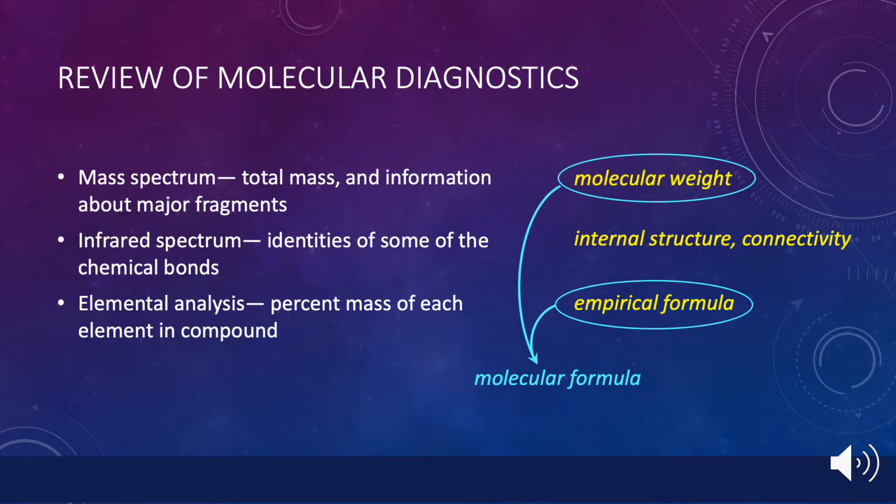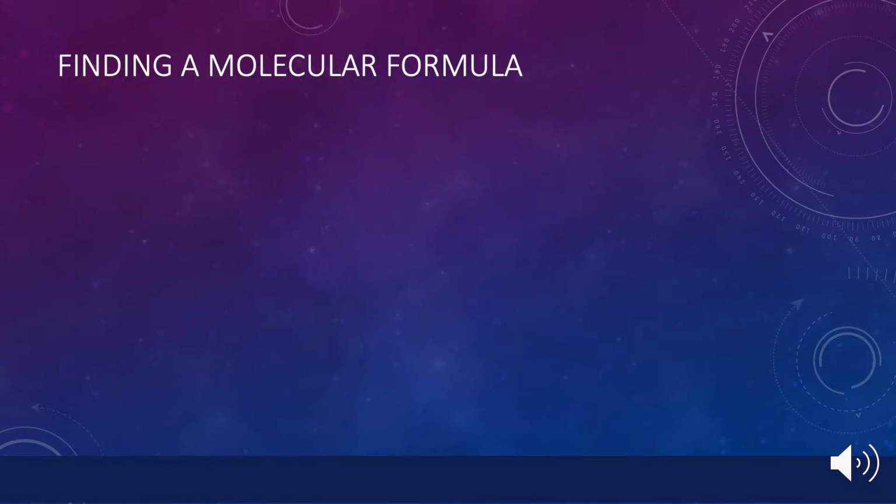We will actually find the molecular formula through an analysis of the molecular weight of the parent hydrocarbon, the molecule in which the fluorines are replaced by hydrogens. To illustrate this last point, suppose that one has a molecule whose molecular weight has mass 138, and we know from the elemental analysis that the number of fluorine atoms is 2.